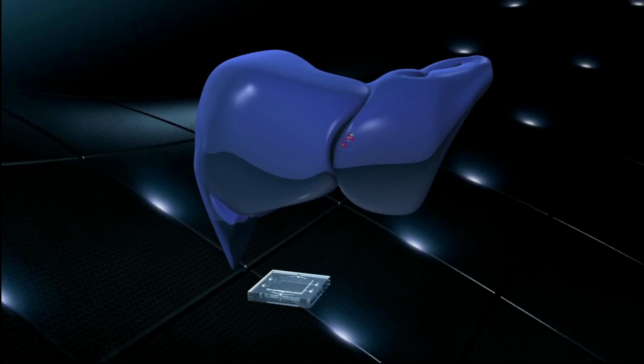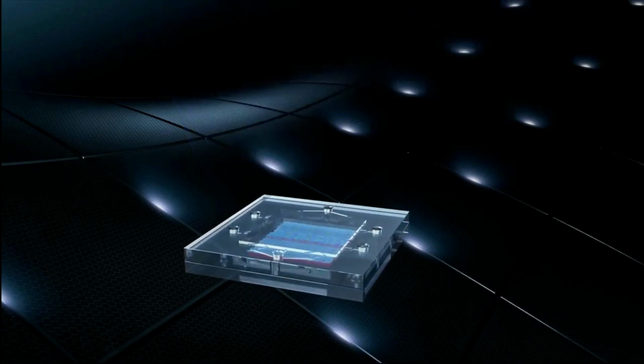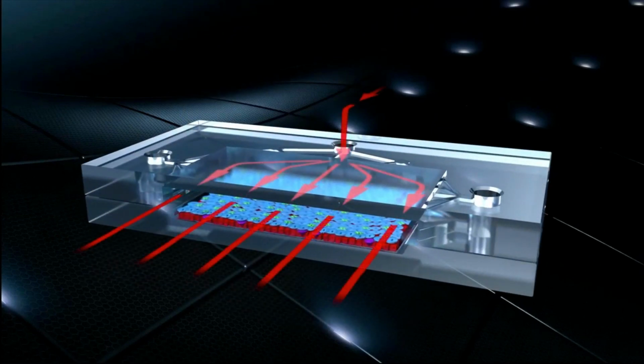The next question is, once these chips are developed, are tissue chips better predictors of human physiological response? To give you an illustration, I mentioned there were a number of organ systems that we're trying to mimic. I'll focus on the liver for now. As you know, the liver is responsible for concentrating and metabolizing a number of drugs and medications.